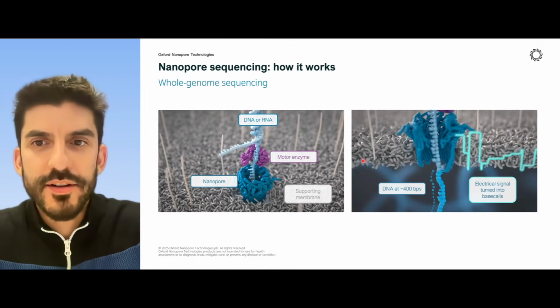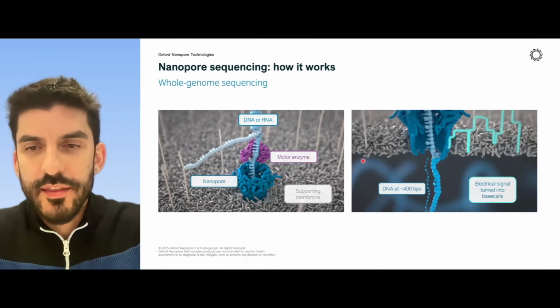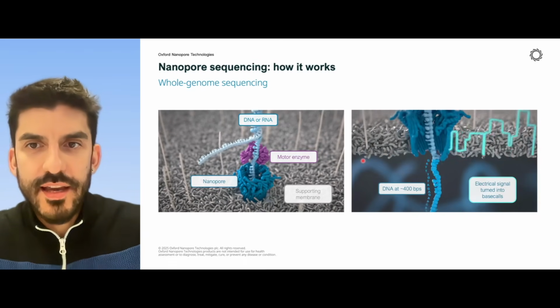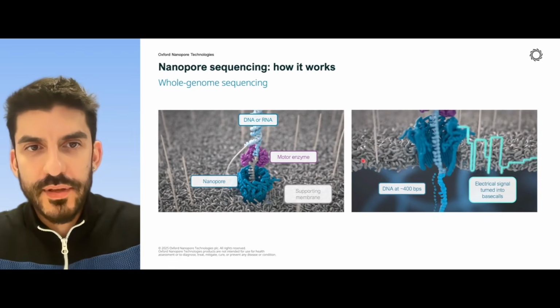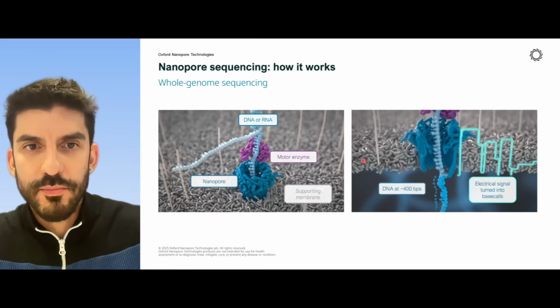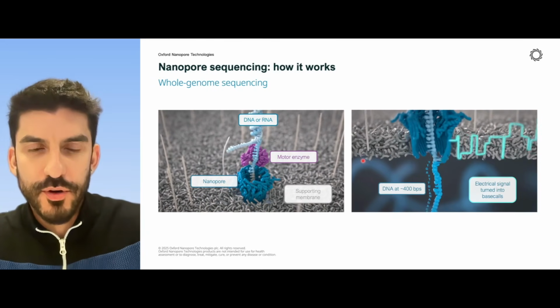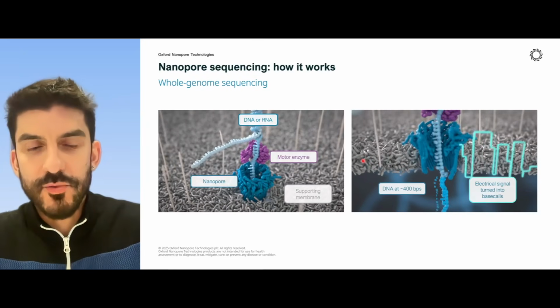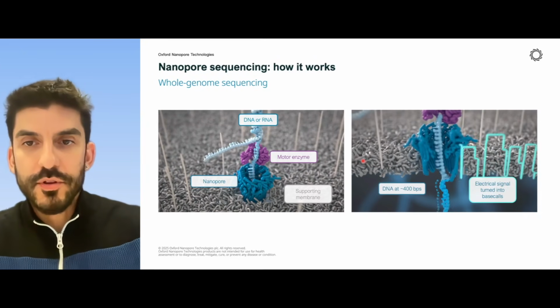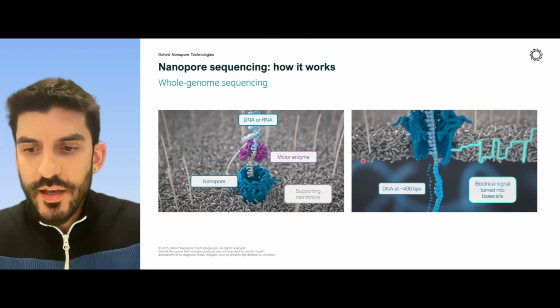So I would like to start by quickly reviewing the ONT sequencing system itself. The way that the DNA is sequenced with our platform is that we take strands in a sample and they get attached to a pore, and as they go through the pore, the signal is collected in real time regarding whatever bases are going through the pore at any given moment.